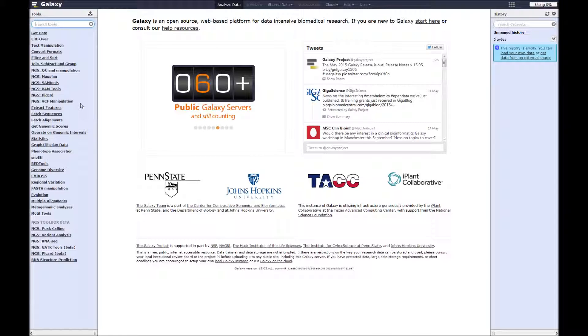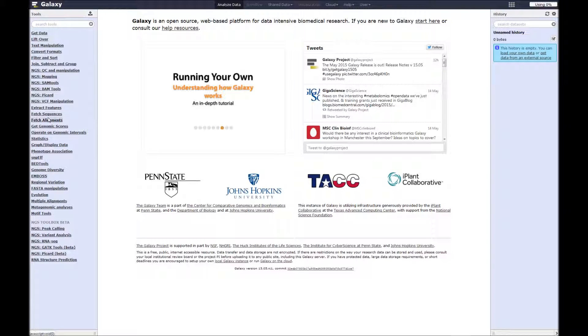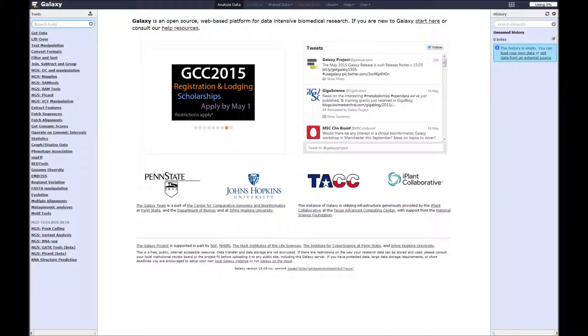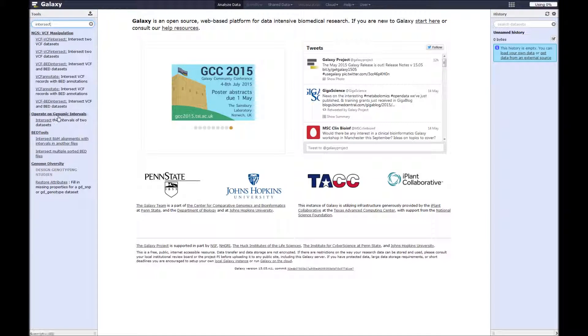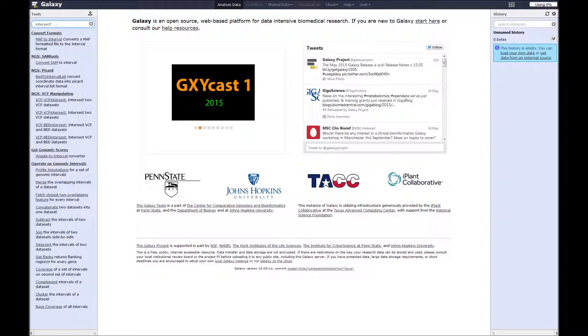Just a quick mention about the tools menu. Each of these links opens up to lots of different tools. So it can be quite daunting to find the thing you actually want. There's this search bar here. Say you wanted to intersect two data files or records. You could start typing intersect here. And after it thinks a little it will come up with all the tools that have intersect in their name. For example here we have operate on genomic intervals and we have intersect the intervals of two data sets. This can be quite handy if you're not sure where a particular tool lives.